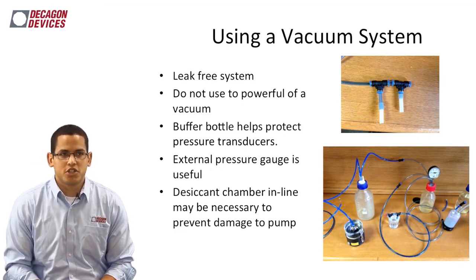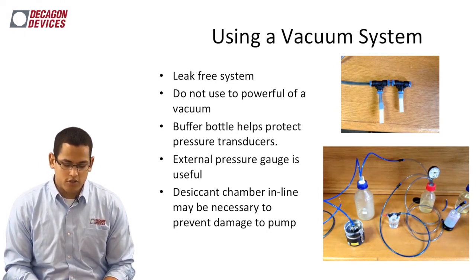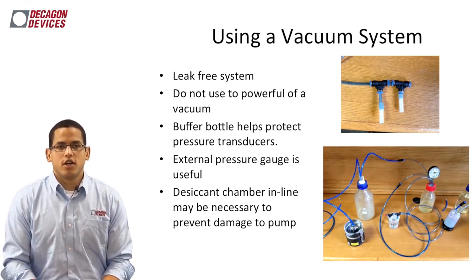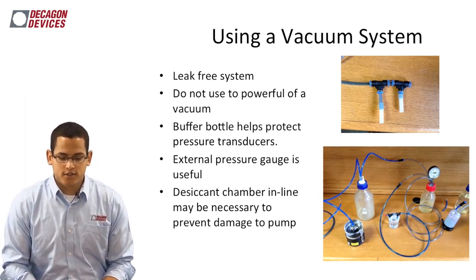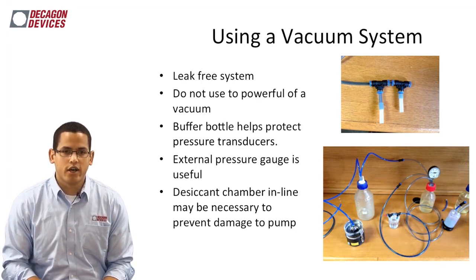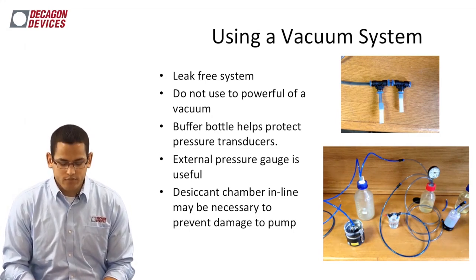One thing you especially need when using a vacuum is a leak-free system. So that goes into the type of line you use and the type of connectors you use. You don't want to use old line or old connectors, because you run the risk of having a leak.